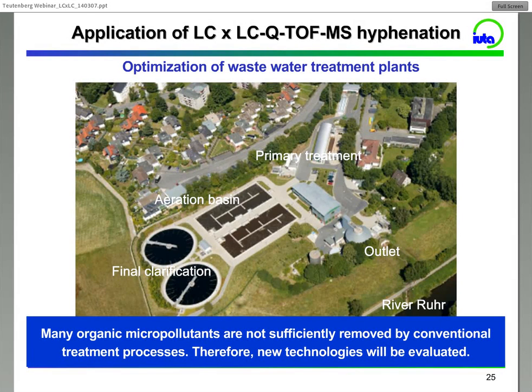It's ozonation. And this picture is not that up to date. On this site, an ozonation plant has been built to study the degradation effect of ozonation. But this was not important for us. We wanted a sample with a high matrix load. So a sample was collected from the influent to the wastewater treatment plant.